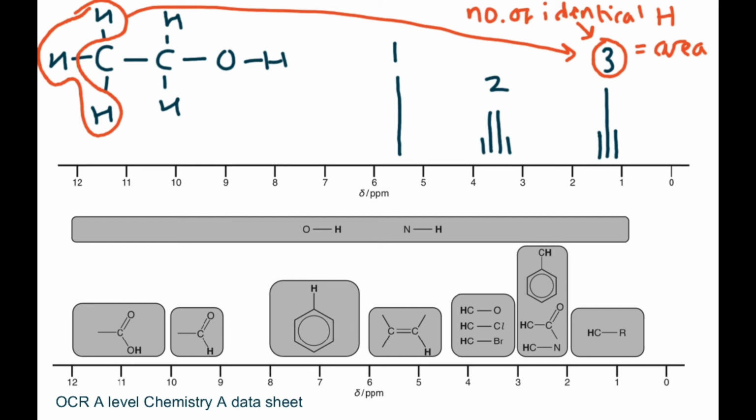So in a carbon NMR, you've always got a single line. Note here that we've got 3 lines. We call that a triplet. It follows Pascal's triangle in its shape, and the maths behind it as well. So the signal has been split into 3 lines. Take away 1 equals 2. That information tells us that there's 2 hydrogens on the adjacent carbon.